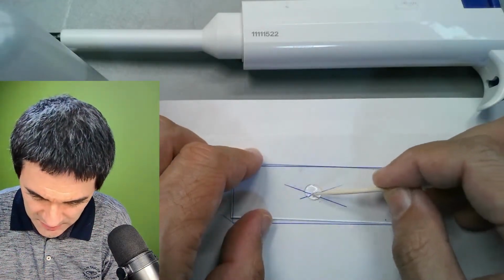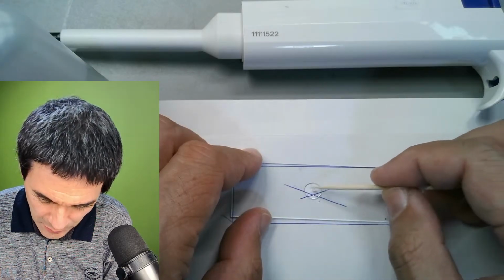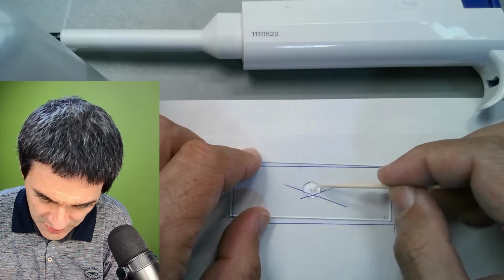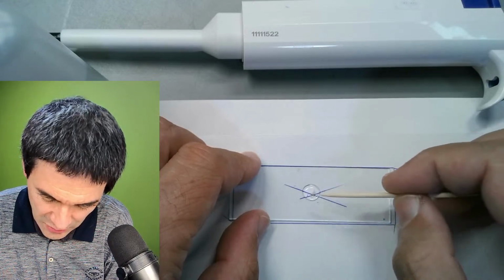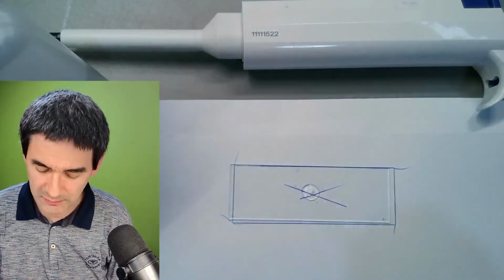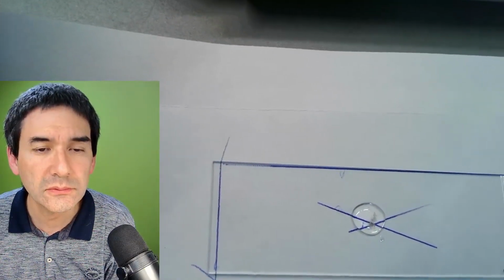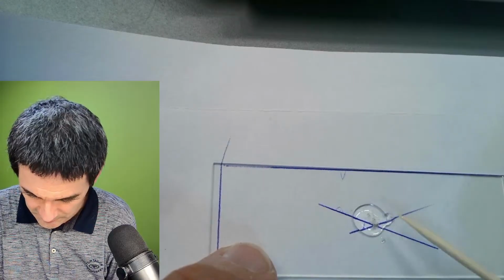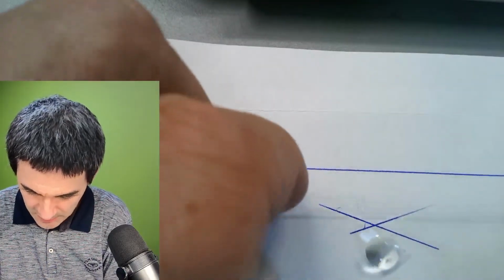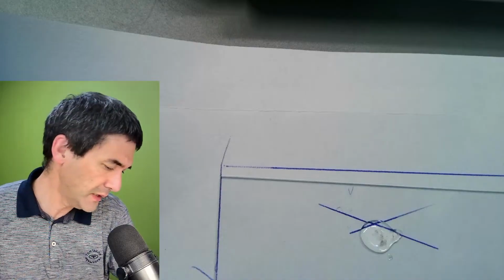What sometimes is a good idea is to spread them apart a little bit, because those trichomes, which are planted here, sometimes like to stick together, right? So that's hopefully good enough. I don't know how many there are. Okay, there are going to be a few. You know what? Maybe we're going to add a few more.